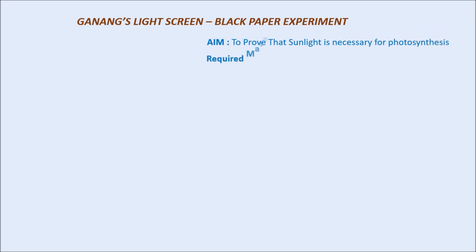The required materials for this activity are: a potted plant which has already been destratched for a week, a light screen, and iodine solution.